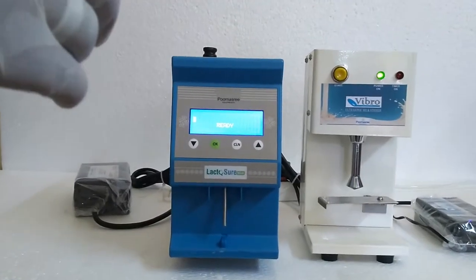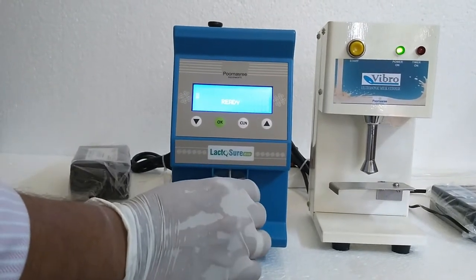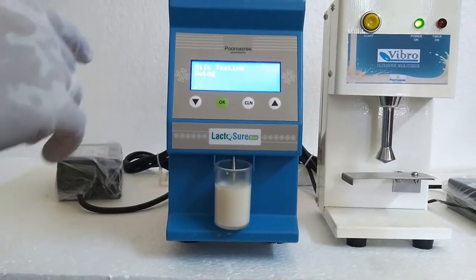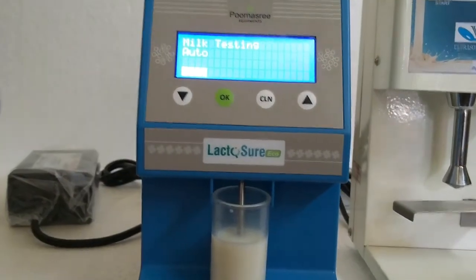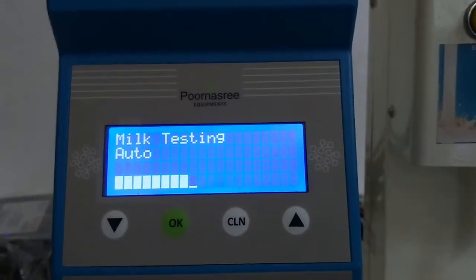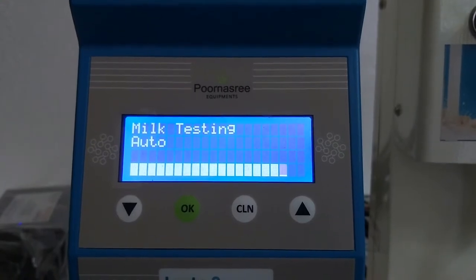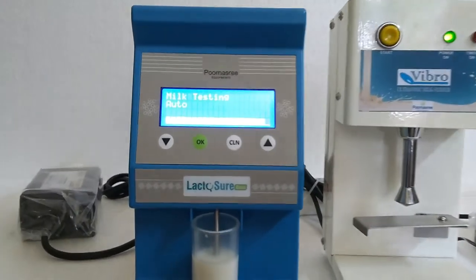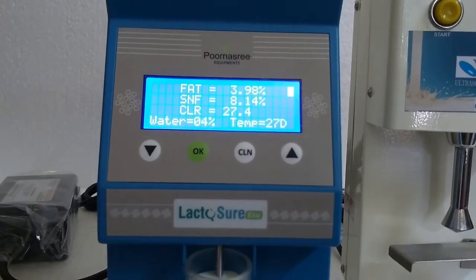Testing procedure: Take 20 ml of milk inside the bottle and place it in the analyzer. Then press OK. The milk testing is now going on — it will take some time to show the result.